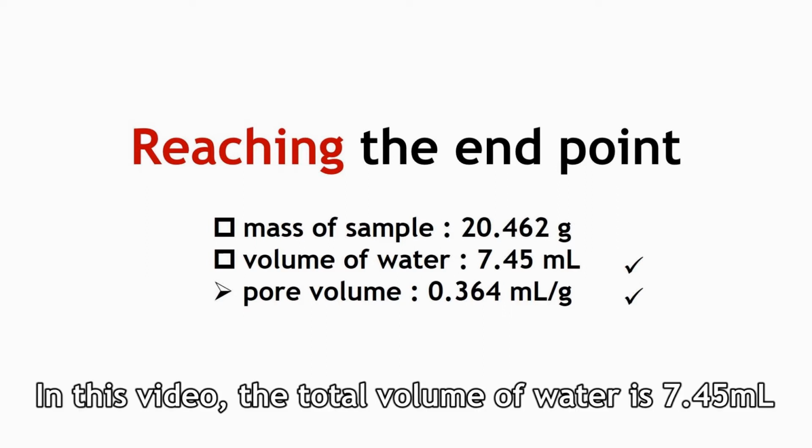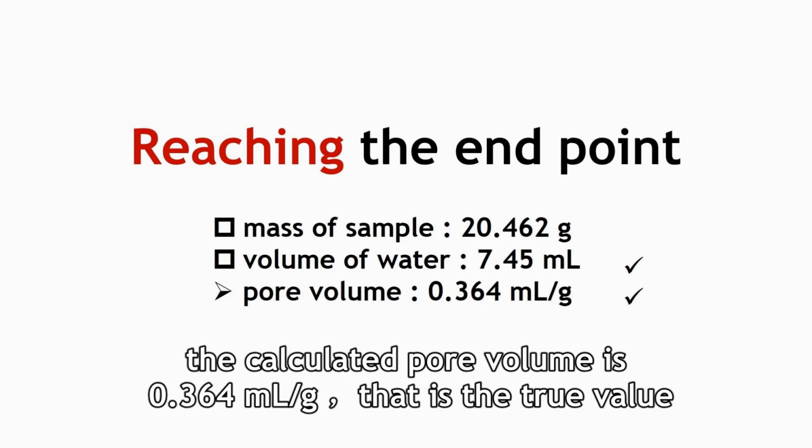In this video, the total volume of water is 7.45 ml. The calculated pore volume is 0.364, that is the true value.